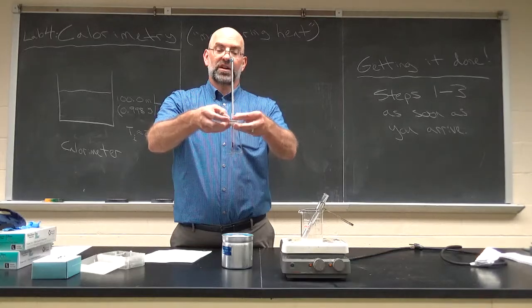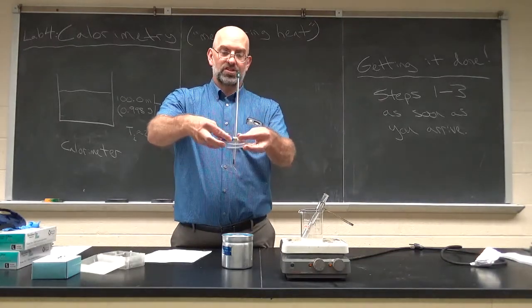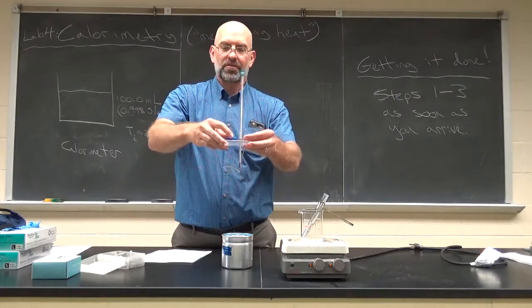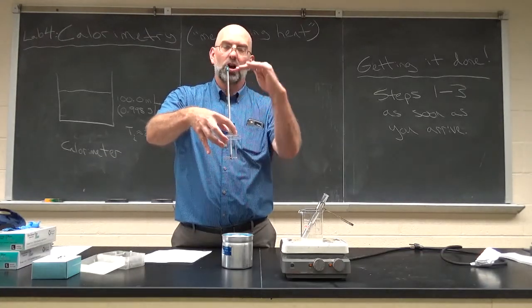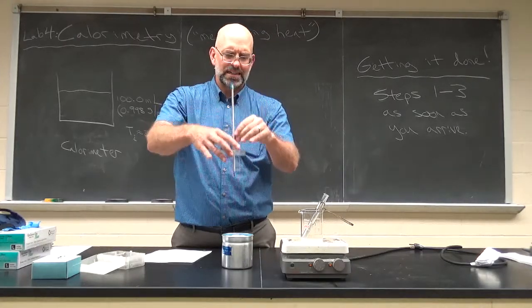Maybe it's good that I do this so I can show all the things that could go wrong. You don't have to worry about this. That's just, yeah, that'll just release into the atmosphere. You leave that on. And this is there just to stir the water and make sure it's homogenized. The temperature, when it goes up, goes quickly. So you can use this if you want to. You don't really need to.